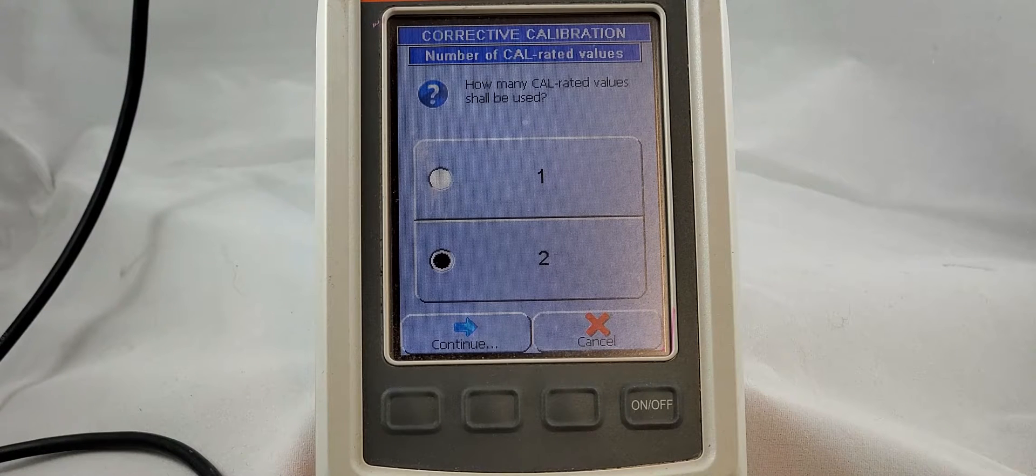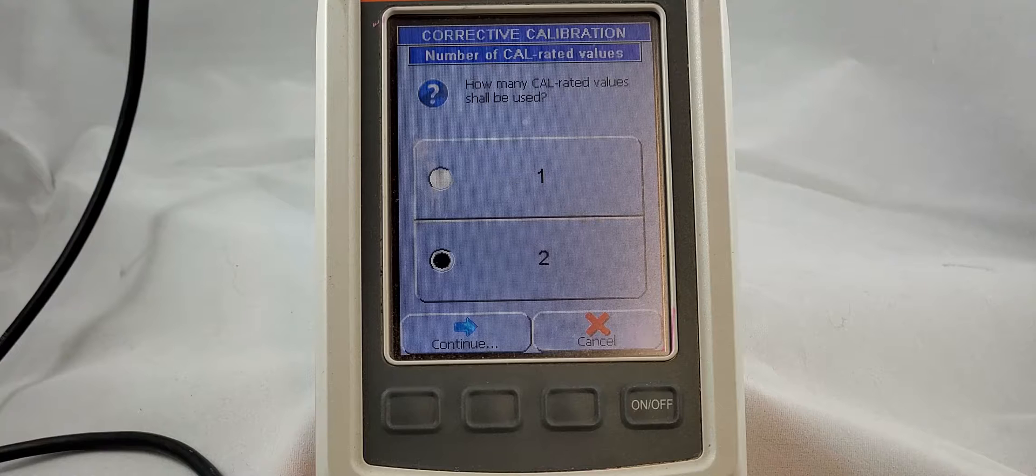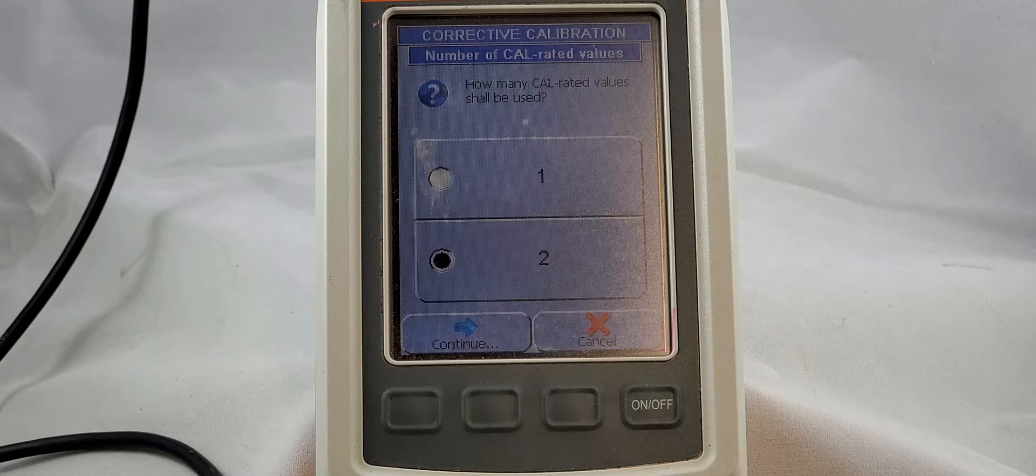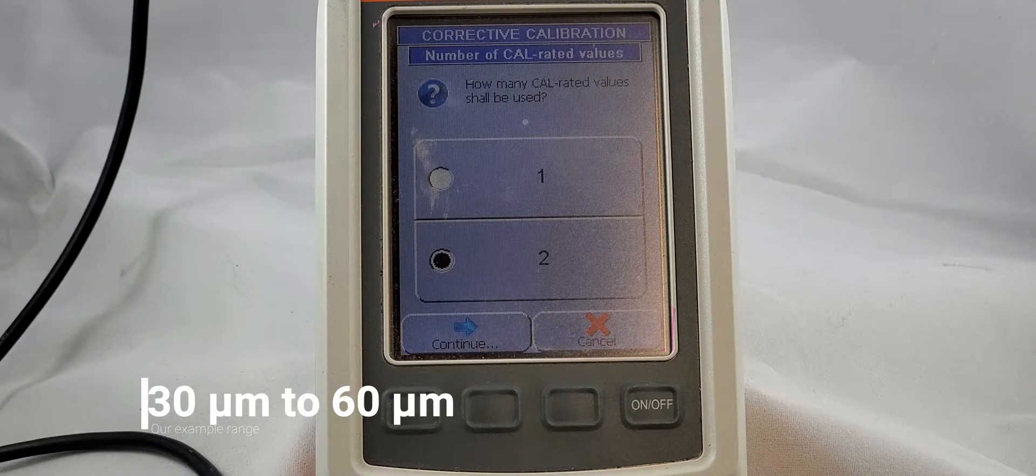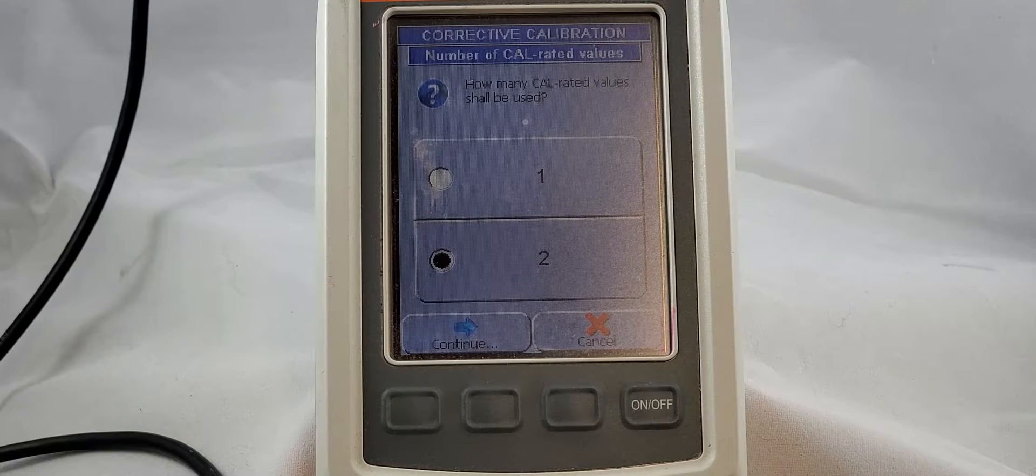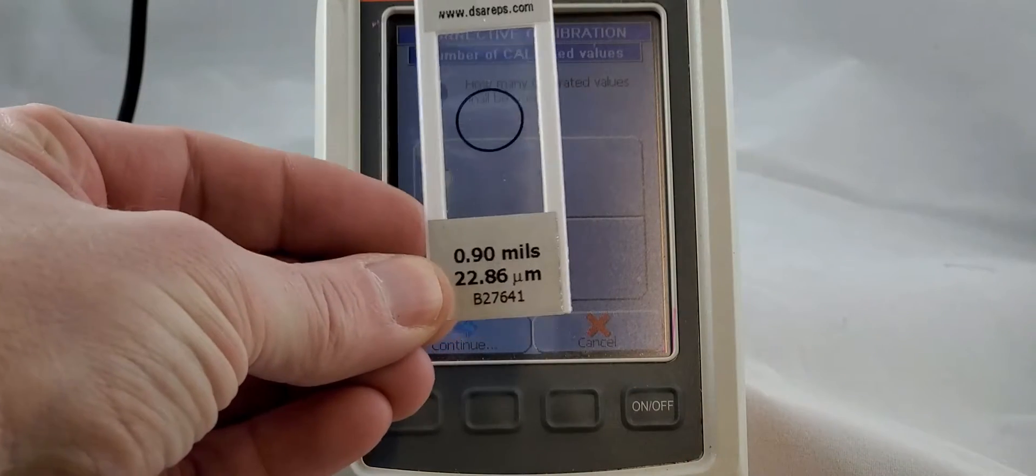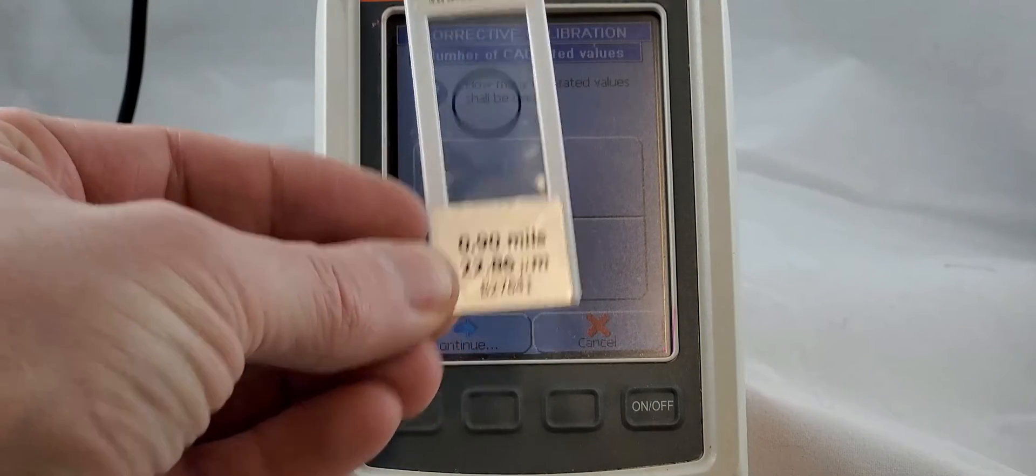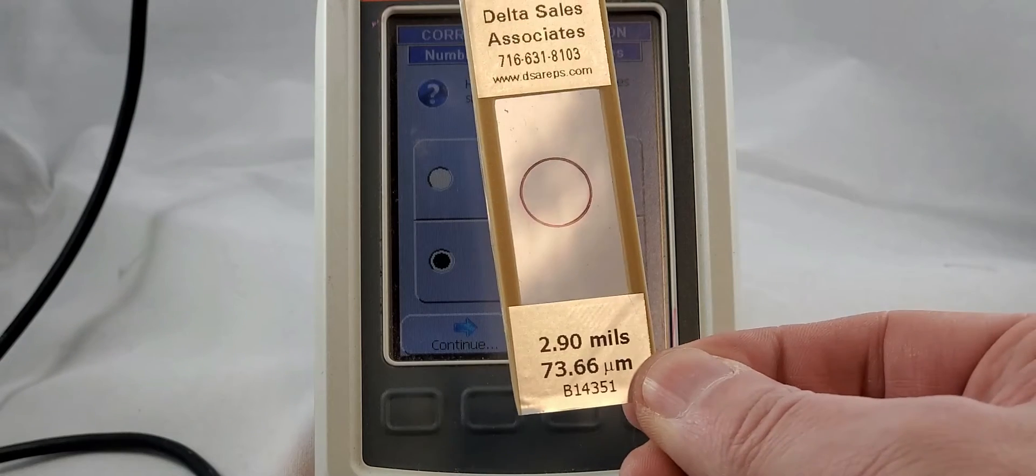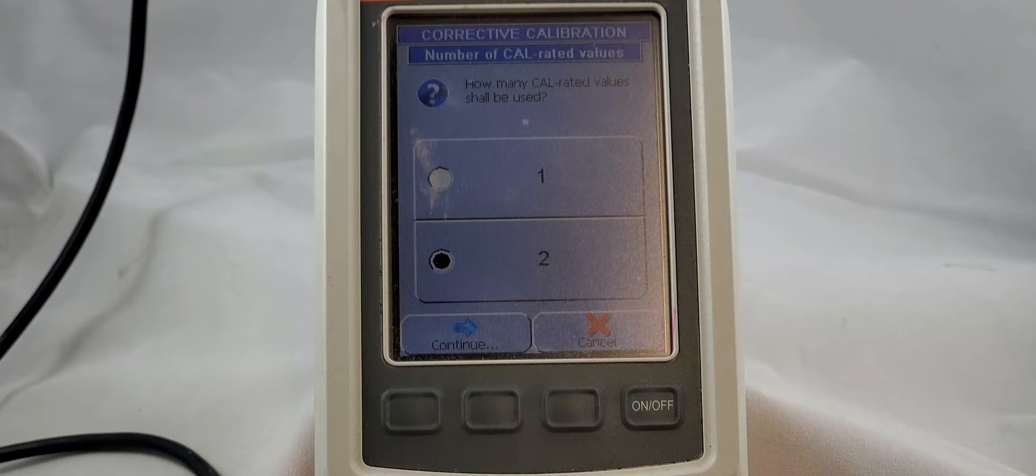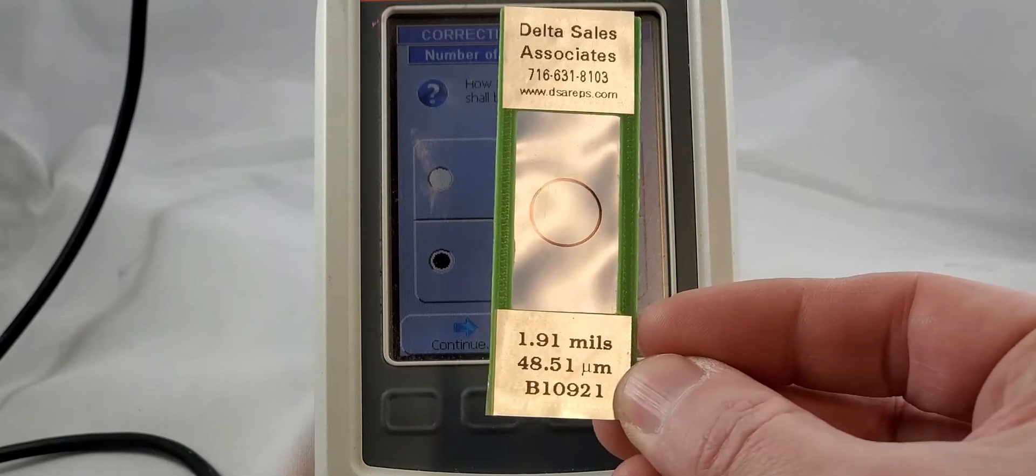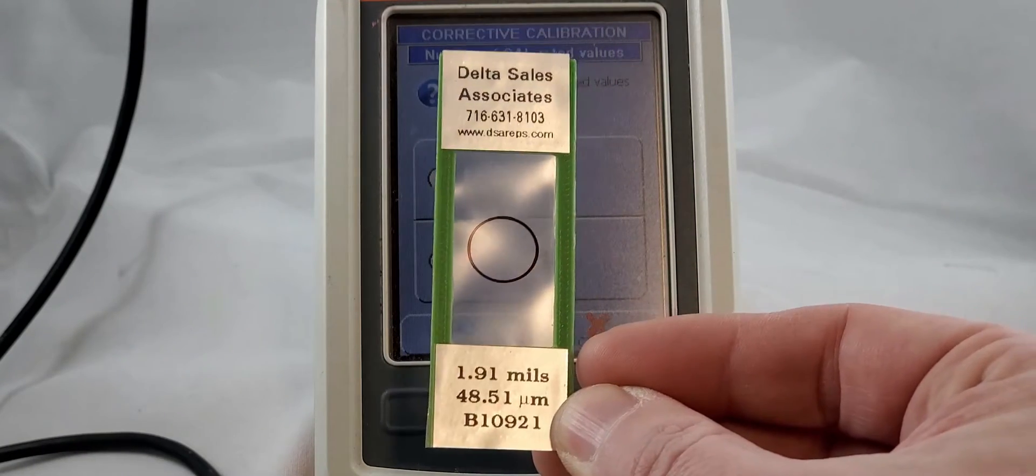If you have the option to use two different calibration standards, I highly recommend that you do that. Typically you are going to want a calibration standard that is just below your required range and just above. So for today let's say that our range is 30 microns to 60 microns. So we are going to want to have a low value less than 30 - 22.86 pretty good - and above 60, 73 that'll work as well. And then when we're done with our calibration and we want to test everything, we're going to want one right in between as well. So that's where our 48 and a half is going to come into play.